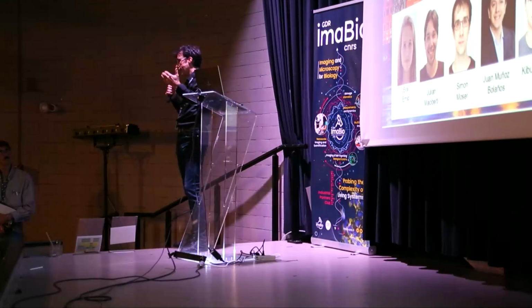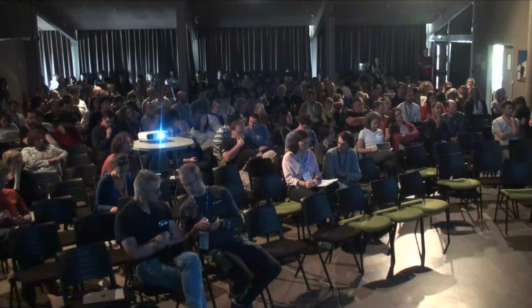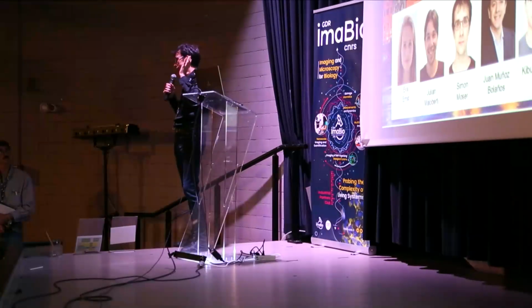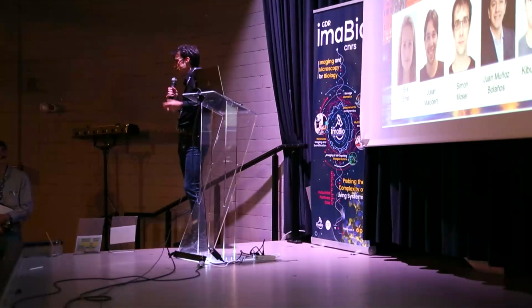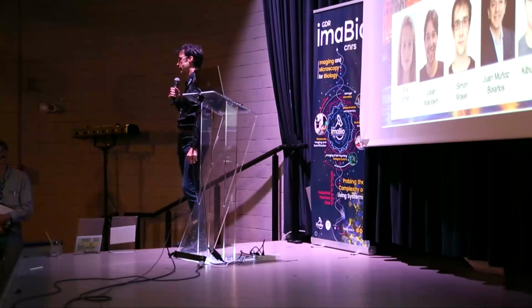The only thing I can do in the end, if I detect a large defocus component in my phase pattern, is to try to get rid of that, for instance. But where the focus exactly will form, I don't really know. But I don't need a guide star, right? Yeah. Okay.